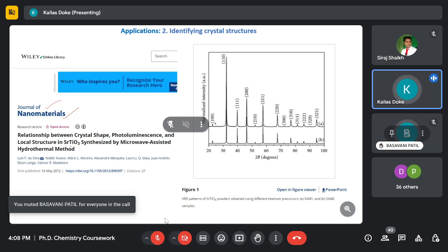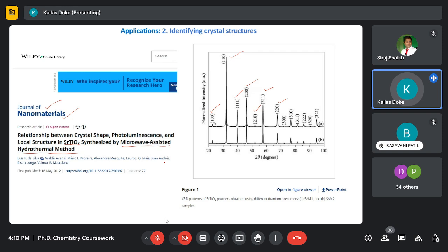So this 111 stands for HKL, 200 stands for HKL, but with different distances between the different planes. So how did they index each of these peaks? By using some mathematical calculation, they might have used, or they may have used, auto-indexing. So suppose you analyze any powder XRD, and if you don't get this diffraction pattern with auto indexing, then you have to do a lot of calculations.